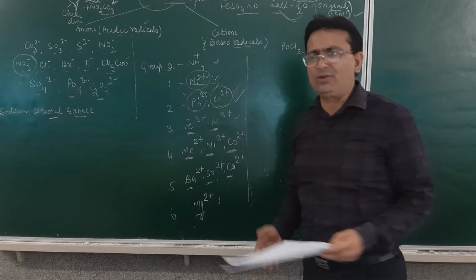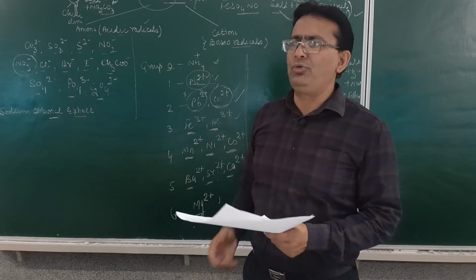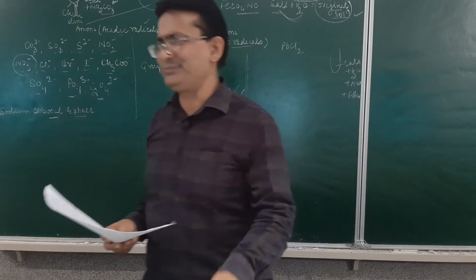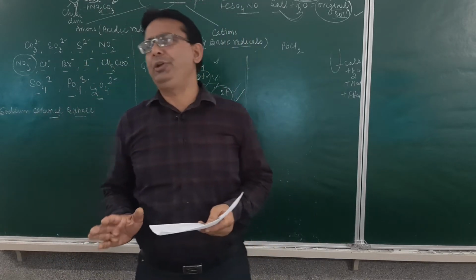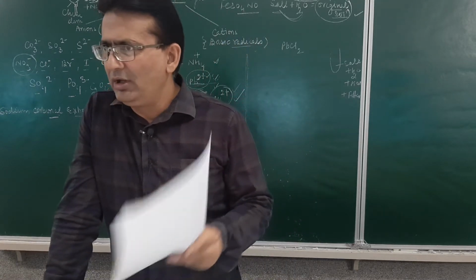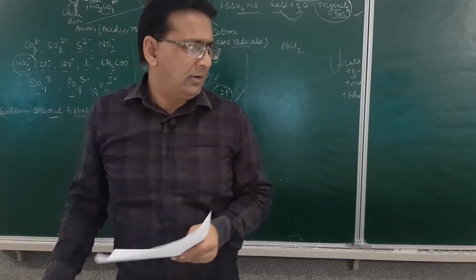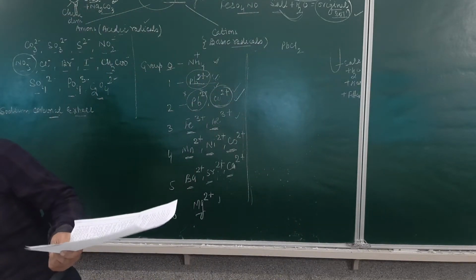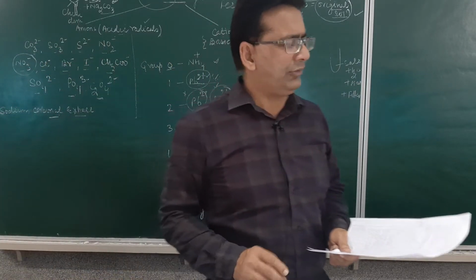Now, all of you, please check, you have got this study material with you. This has been provided to you because in this lockdown time, I think many of you must not be having the practical book. So that is why this study material is being provided to you. You have to keep it with you at least up to the final board examination, from where you can learn the tests. This is one practical where the tests are to be given. You have to learn these tests. Am I clear? Now, what is to be done over here?